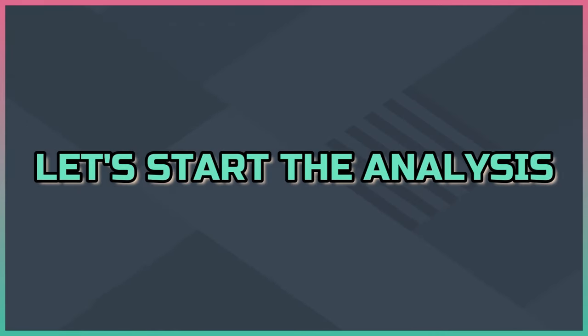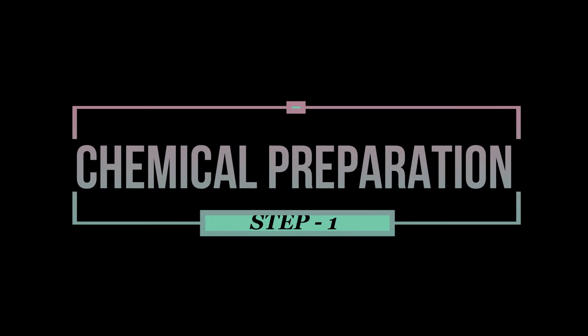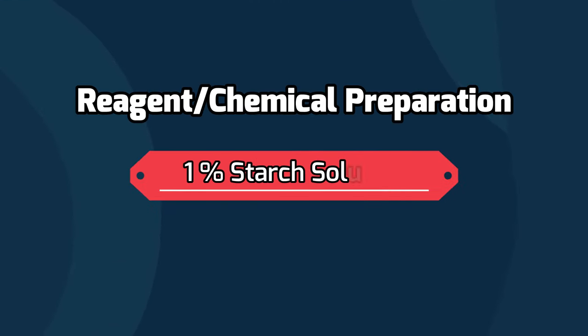Let's start the analysis. Chemical preparation is very crucial for any test. Before going for the main test, we will prepare chemicals and reagents.